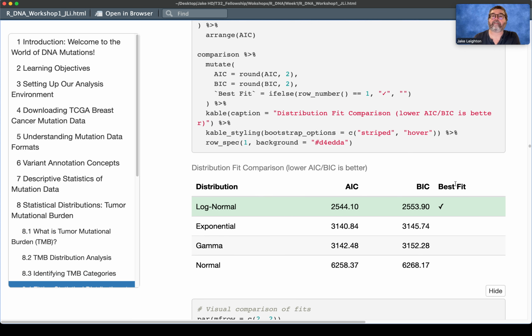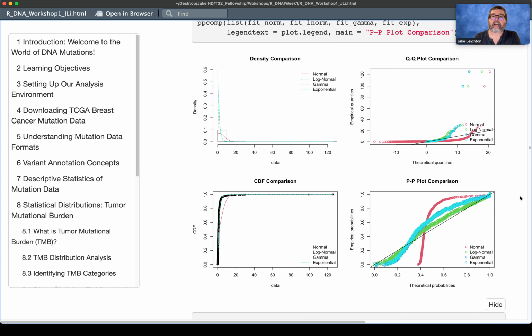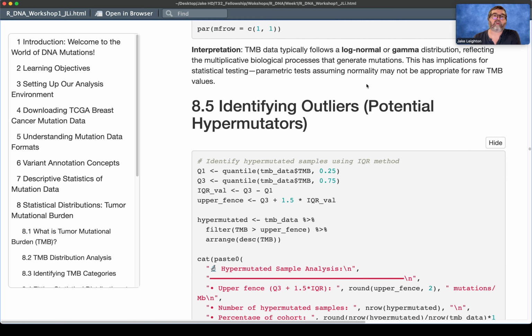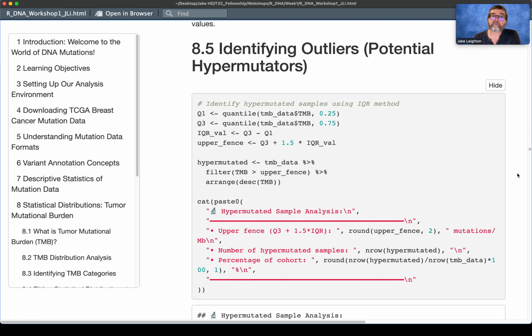And so log normal is being fit to that distribution exactly the way we thought. And, advanced people, you can check this out a little bit better. It's just showing how well that fit. But this is once again showing that it normally does a log normal distribution.